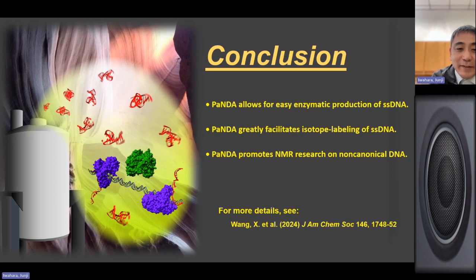All right, so here are some conclusions. This method, which we call PaNDA, allows for easy enzymatic production of single-stranded DNA, and PaNDA also greatly facilitates isotope labeling.